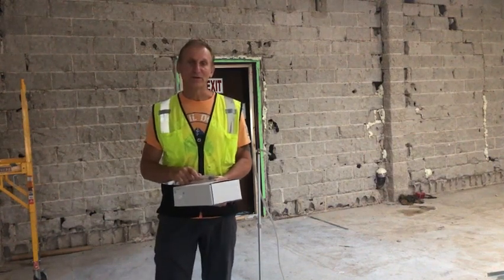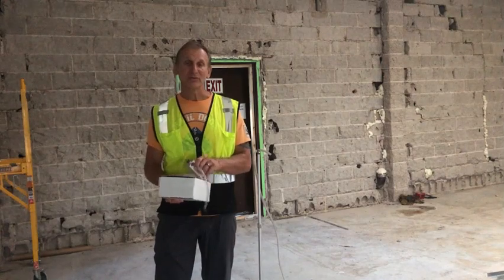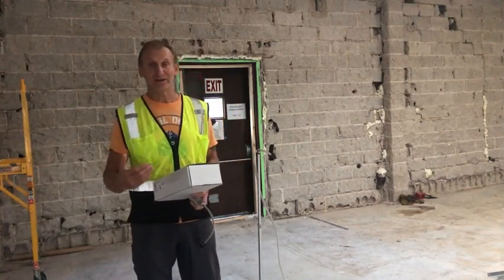Hi, this is Peter Wilk, environmental instructor and inspector. Today I would like to show you how we do an asbestos air quality test.